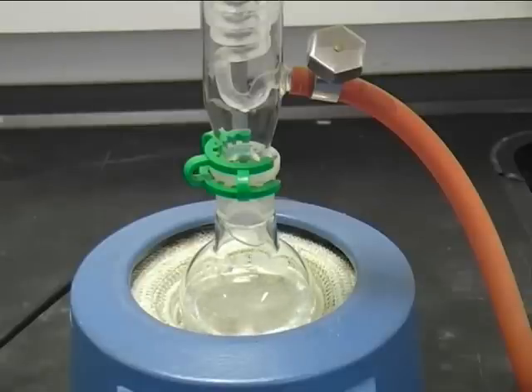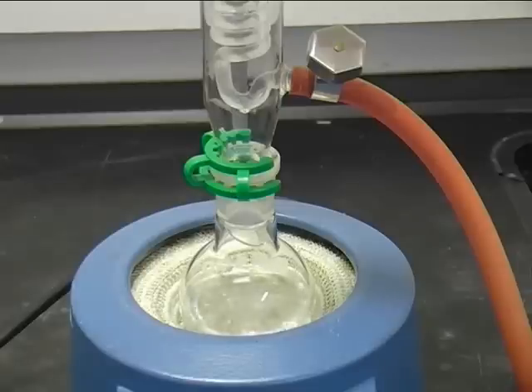Here you can see the typical reflux. That just means that your liquid in the round bottom flask is boiling and then condensing at the water-cooled coils, which you can see at the top of the picture.